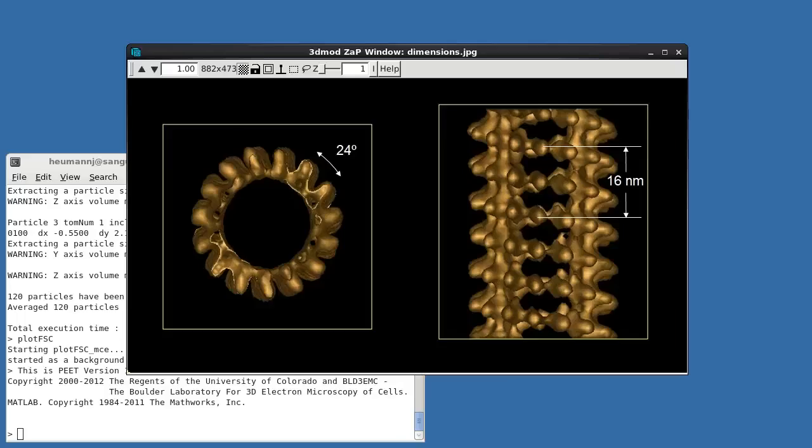Recall that we requested our averages be aligned vertically. This will be useful during symmetrization since axial rotations can be implemented as simple rotations around the y-axis. Vertical alignment is done only during final averaging, however, and as a result will not be reflected in the final motive list. The motive list angles reflect only the rotations required to align each particle to match the orientation of the reference. We'll need to apply an additional rotation to recover the desired vertical alignment.